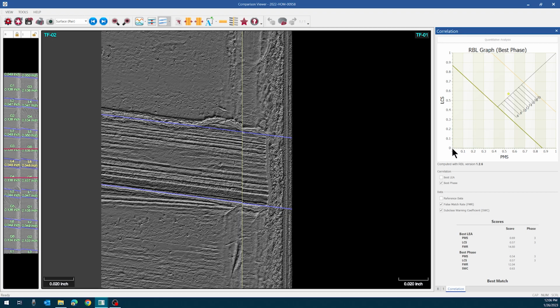And then to establish the false match rate, we go from that lower left portion here and extend upwards. And we can see the ladder of numbers here from 20 counting down to 12, 10, 8, 6. Right here, where what would be a value of 4 is what we call the separation line.